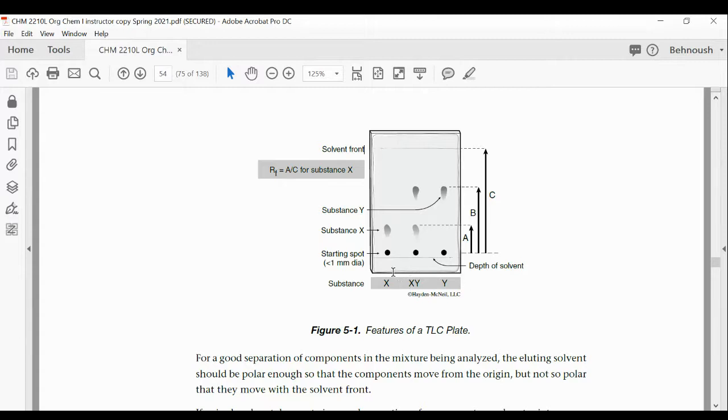And then you bring your solvent. The solvent is going to move up on the TLC plate by capillary action. And when it goes up, your sample has a choice to move up with the solvent or stay longer and interact for a longer time with the plate, with the coating on the plate, or stationary phase. And that interaction is based on, as I think Tarek said, adsorption. This interaction is on the surface, and the sample doesn't get soaked in. It's just an action on the surface.